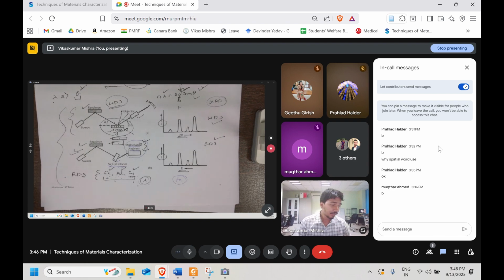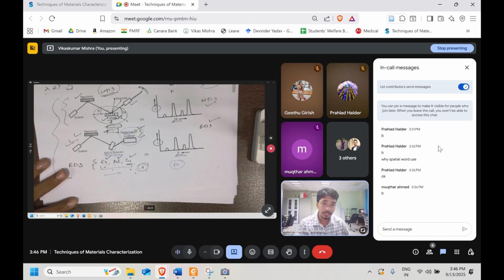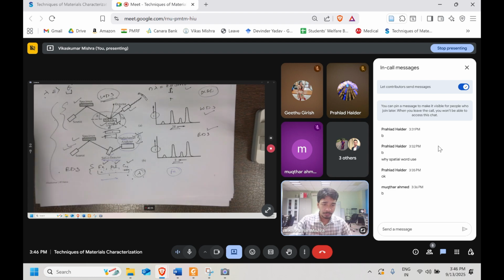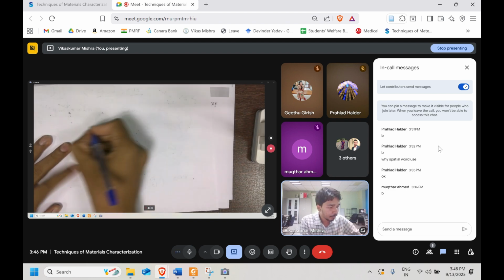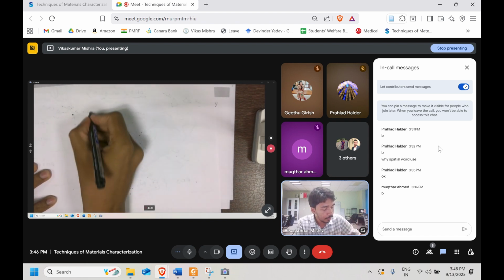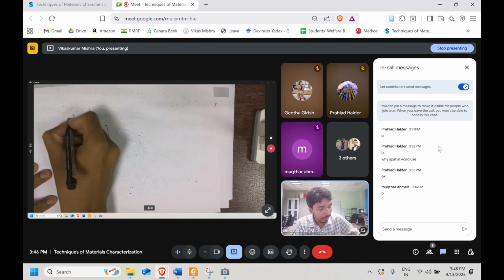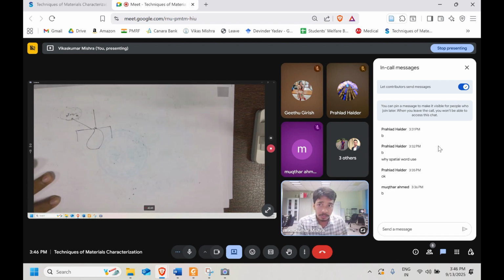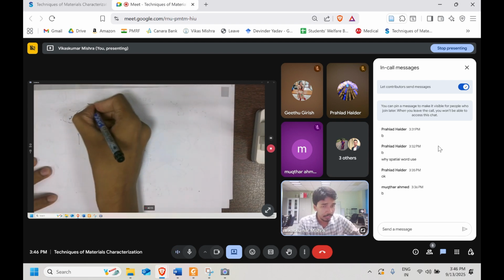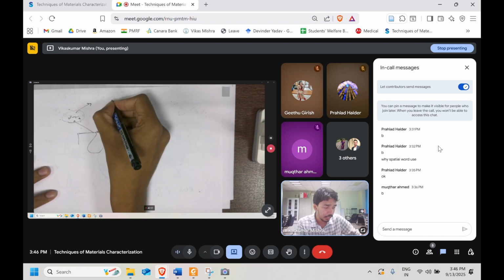The advantage is that here you are analyzing the things based on the energy, right? So even the small amount of deviation, let's say the noise signal, you can produce. For example, let's say this is your specimen. You created an X-ray. Along with that, there will be multiple other signals. Some noise will be there. That can also go and excite our semiconductor, that is the silicon lithium detector.